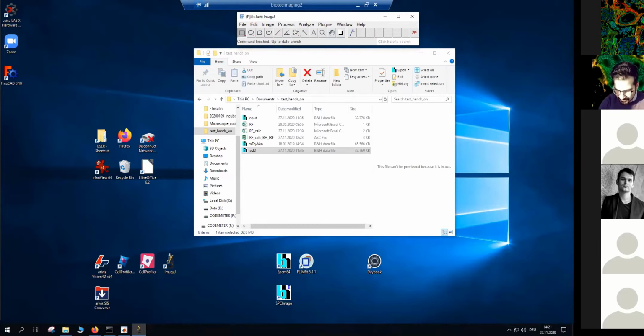So Fiji is a love or hate relationship. Yeah, that's actually correct. Was I missing any question here? Is it because end is set to 0? Liat's saying that, yeah, actually the problem is that it's 0 to 0, and clearly it's not doing what I'm expecting it to do. So the time being of the data that's there, it seems like it wasn't happy with the value I was adding there.